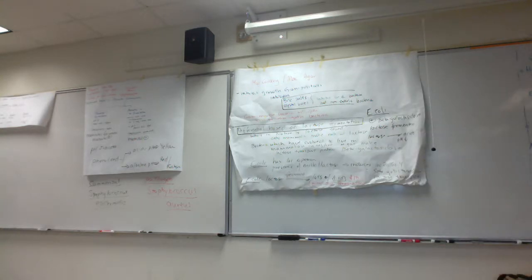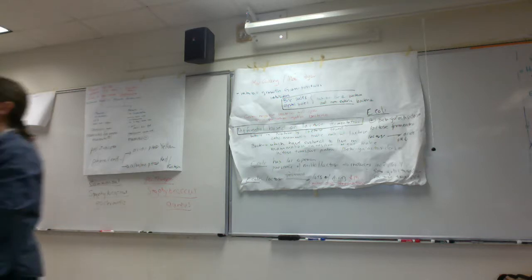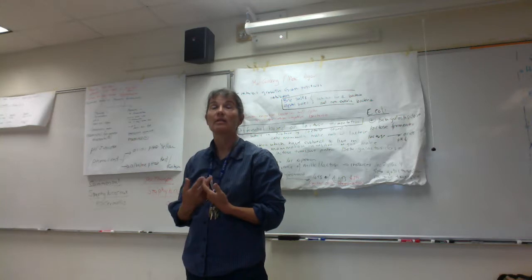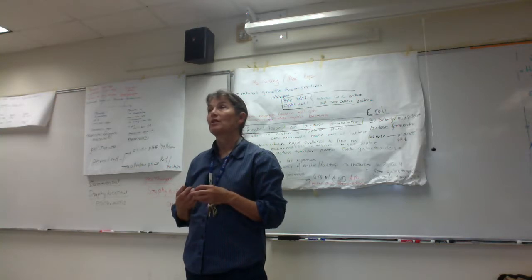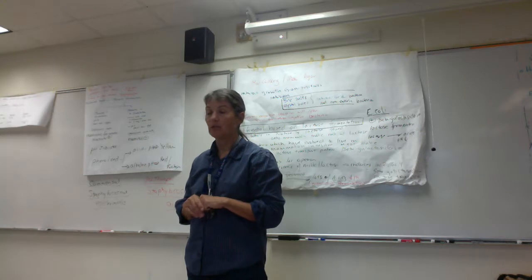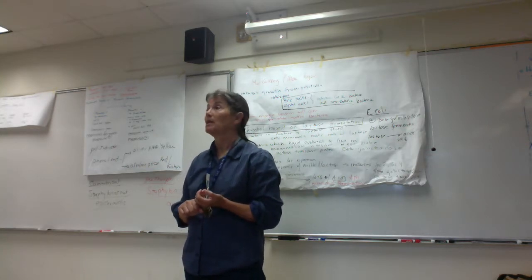And this will take a little background, folks. Okay, so when we're talking about differential media, remember, differential media lets us distinguish or differentiate between different types of microbes growing on our medium. And there's different mechanisms for this. One mechanism is to include some fermentable substrate and ask the question, can the microbe ferment this substrate or can the microbe not ferment the substrate? Now, usually the substrates we provide our microbes in these differential media is a sugar or some kind of sugar alcohol, so that if the microbes ferment the sugar or sugar alcohol, they're going to make acids. And what will happen to the pH?